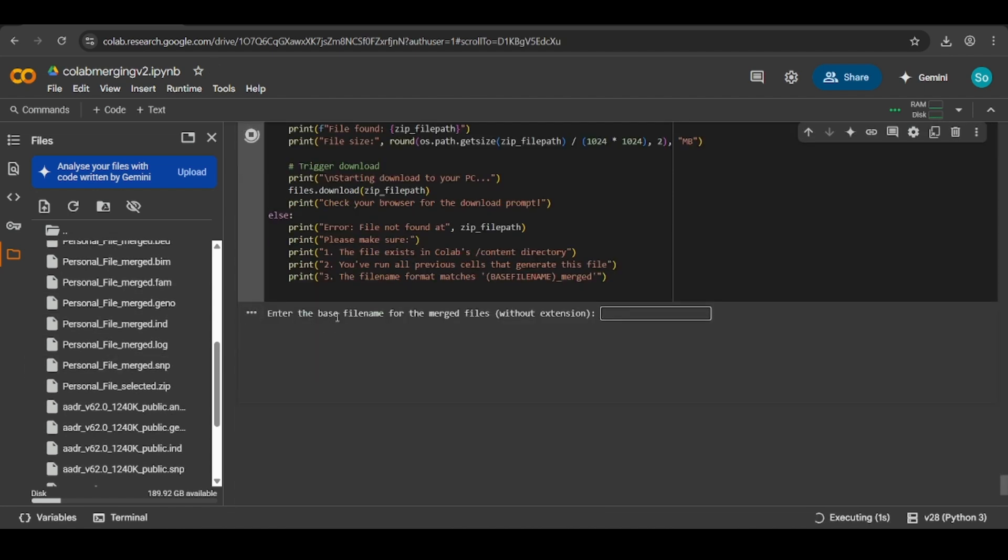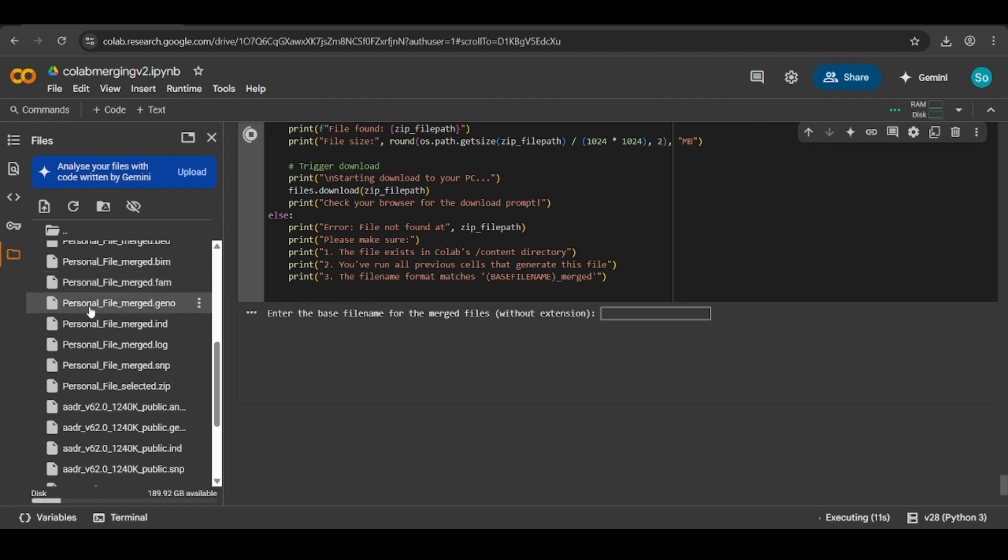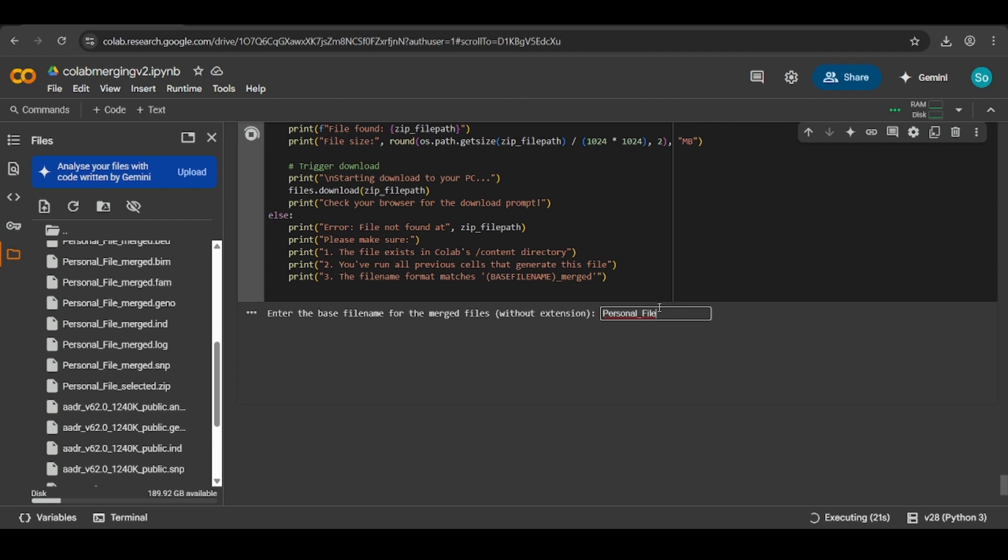Then you want the base file name for the merged files. In this case, ignore the underscore merged part that is here. Just ignore the underscore merged and just enter personal underscore file. We'll do that right now. Personal file. And then you want to hit enter on your keyboard.